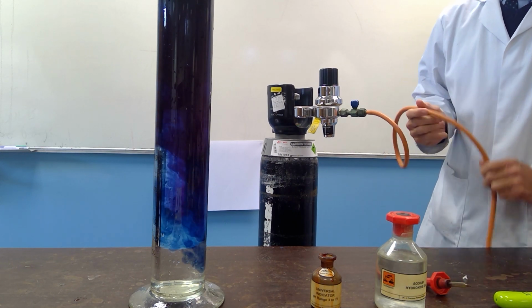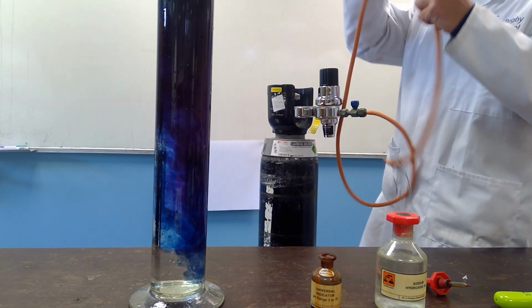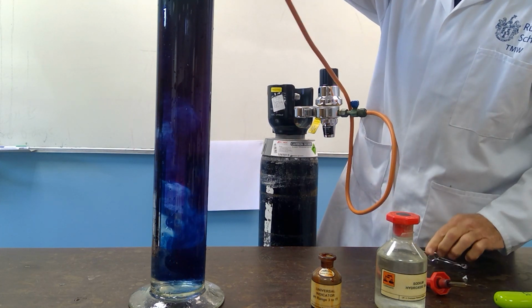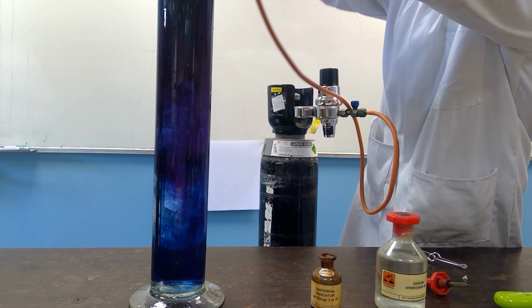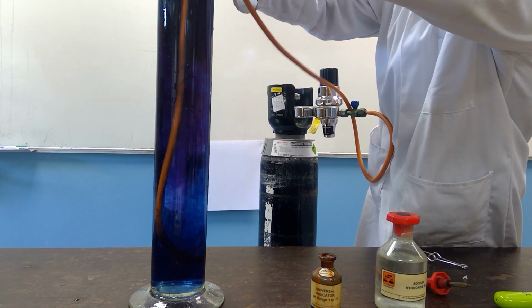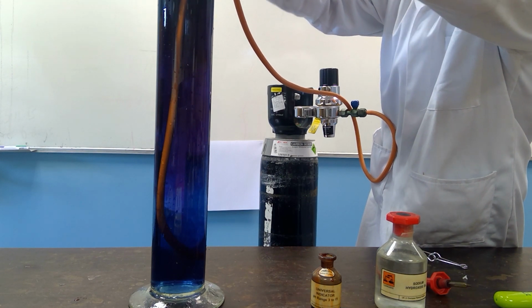In order to show that carbon dioxide is weakly acidic and that it is soluble in water, we will bubble some of the carbon dioxide from the cylinder into this mixture of water with some sodium hydroxide.